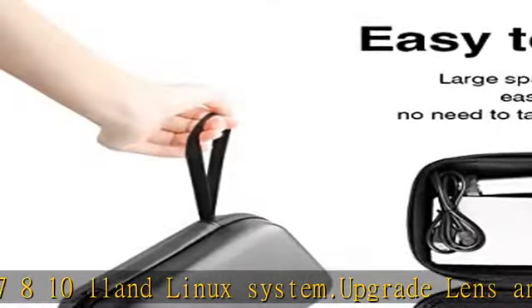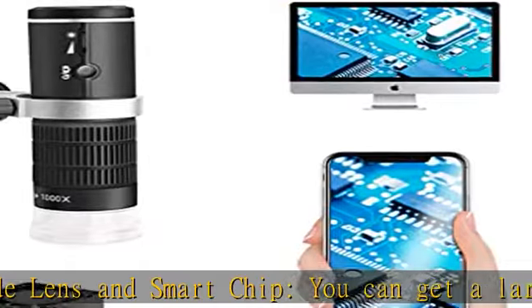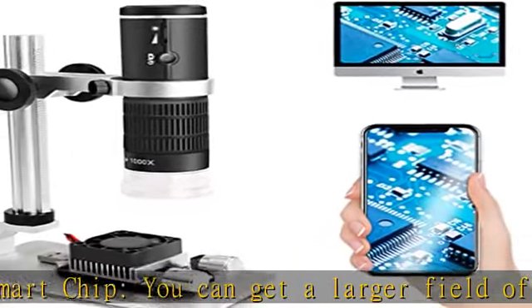High-quality design with 8 adjustable LEDs that can work even in dark places. Soft brightness that will not cause flare or interfere with imaging.